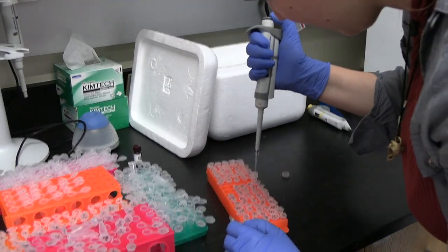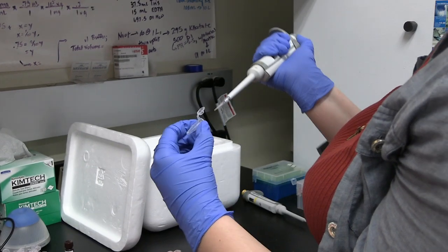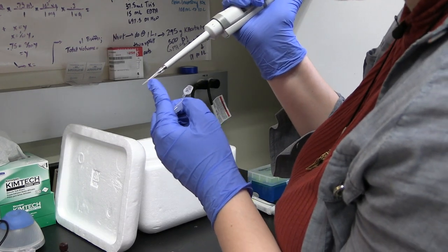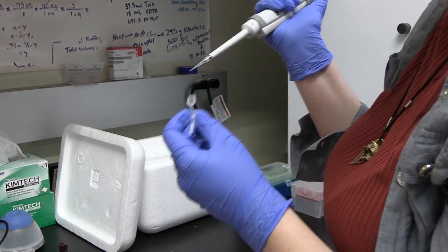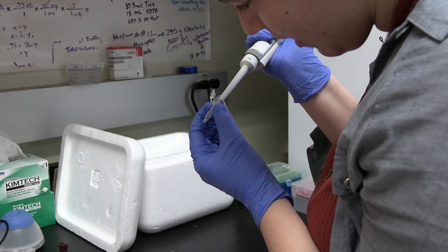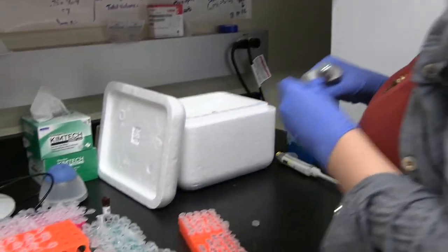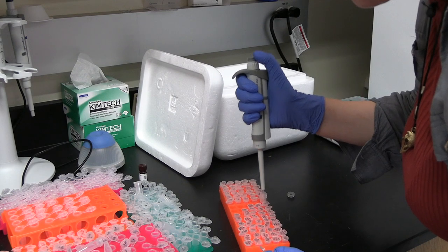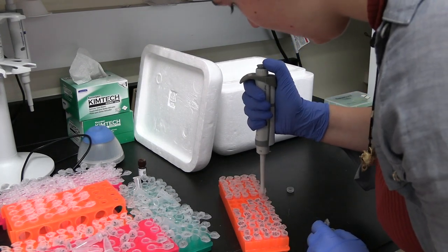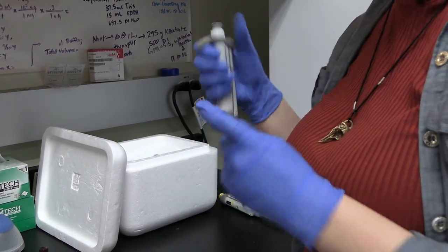And you want to make sure, one thing to check for, so I'm drawing out my solution. I like to hold my tube and my pipetter horizontally, or close to horizontally when I'm pipetting. Just make sure that your solution is just coming to the same height in your pipette tip every time, because otherwise that's an indication that your pipette tip doesn't have a good seal anymore and you should replace it. And then just pipette into there. Close. On ice. And then I'll just try to get through the rest of these quickly. And then once I'm done with that, I'm going to take them off of the ice and then I'll store them desiccated in the minus 20C. Good.